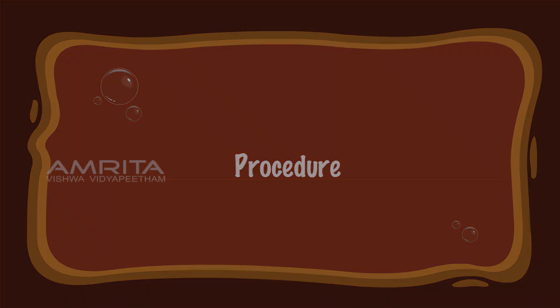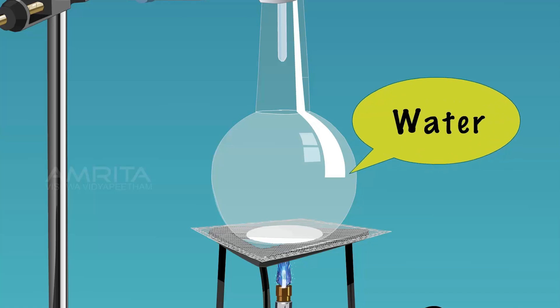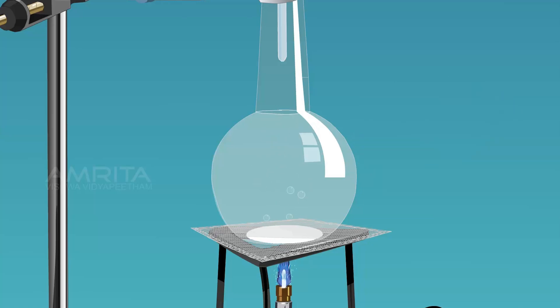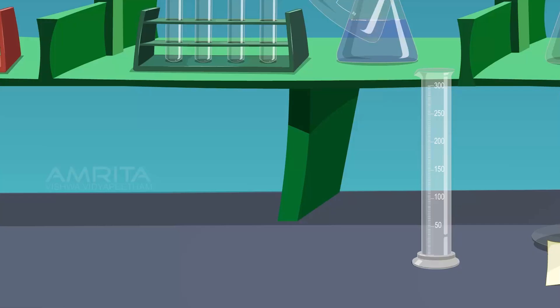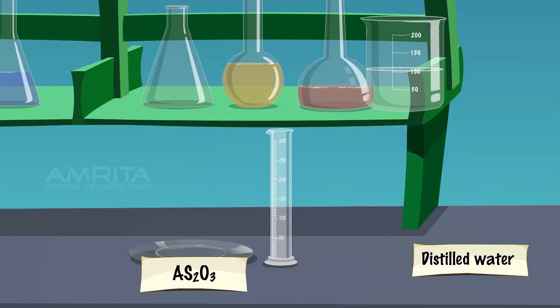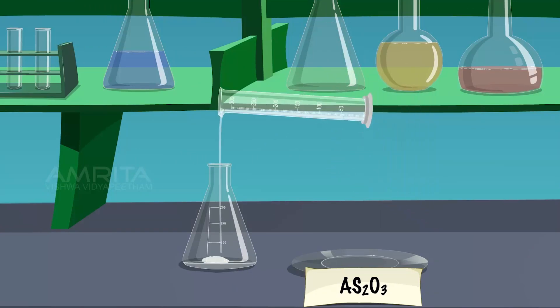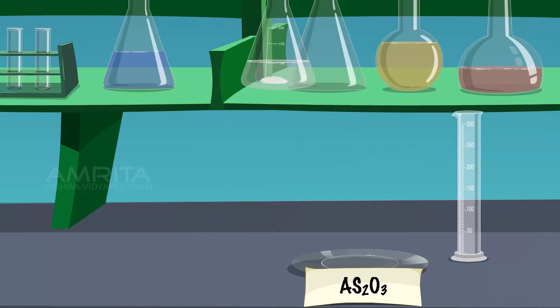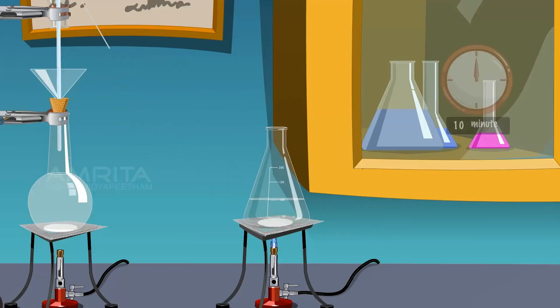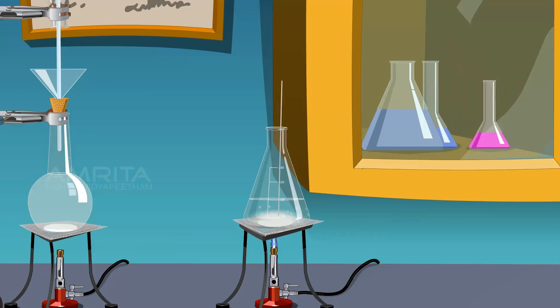Procedure: Take a 250 ml conical flask and clean it by the steaming out process. To this cleaned flask, add 0.2 grams of arsenious oxide. Take 100 ml of distilled water in a measuring jar and pour it into the conical flask containing arsenious oxide. Boil the solution with stirring for about 10 minutes by placing the flask over the Bunsen burner. Arsenious oxide undergoes hydrolysis with boiling distilled water to form arsenious acid.